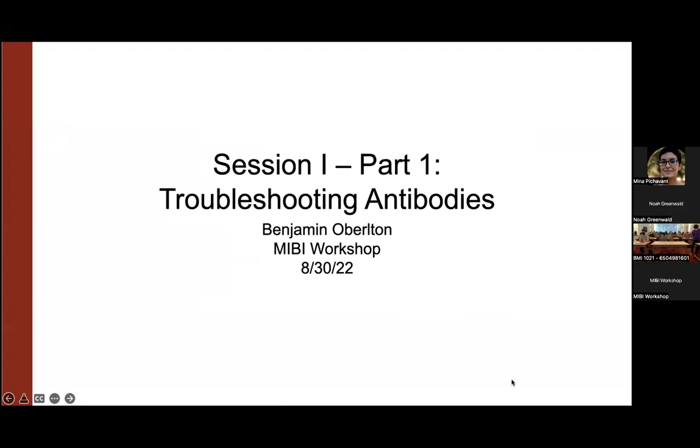Hello, everybody. My name is Ben. I'm a third-year grad student here in Sean's lab. I'm going to be going through a couple of troubleshooting issues or methods that we've figured out for when the antibody's not working.